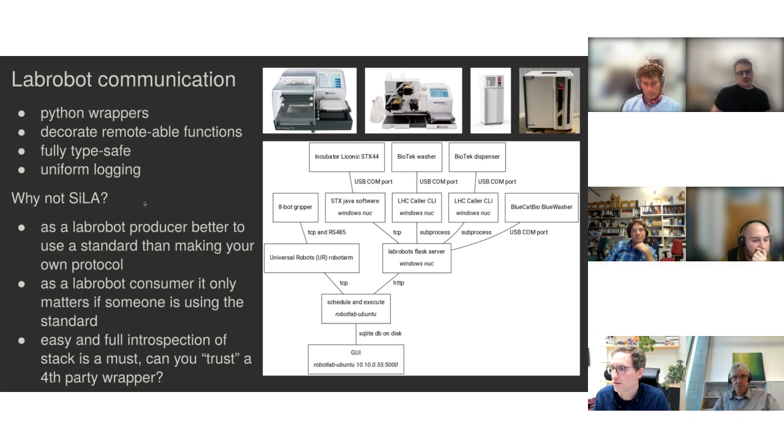So if you compare it with a standardized effort or initiative, it's a bit different if you're a producer of a lab robot or a consumer. We are lab robot consumers in that we use them. And if I have a lab robot and no one has written, or especially if they don't provide, a SILA wrapper for them, SILA is not so important for me.